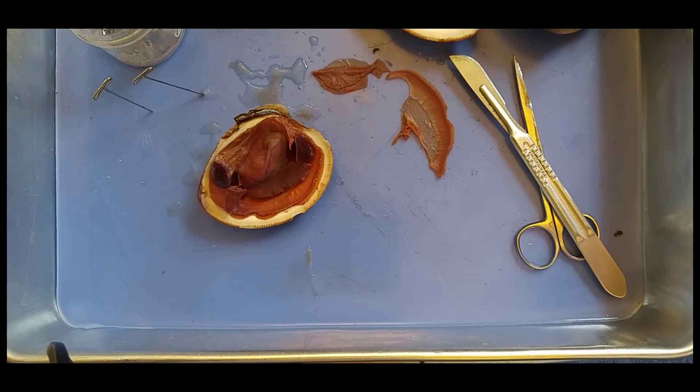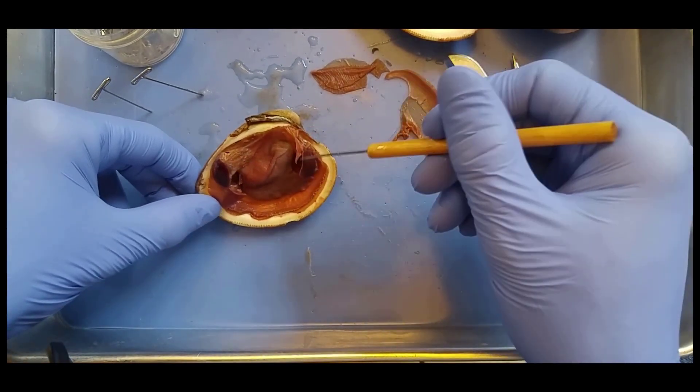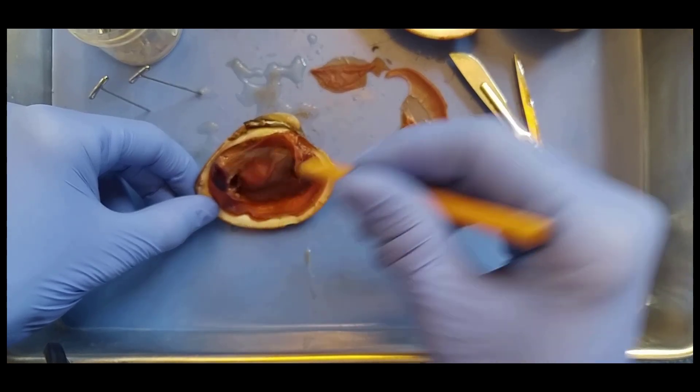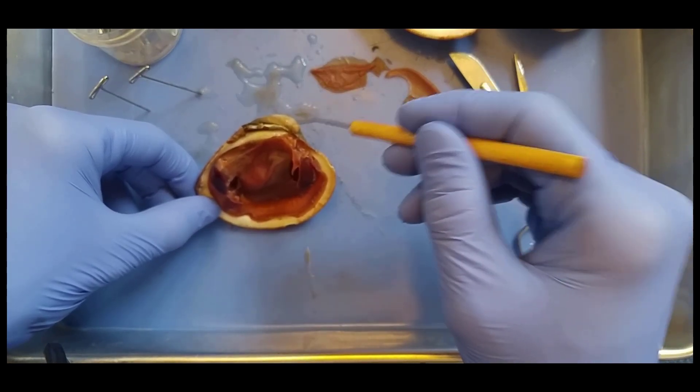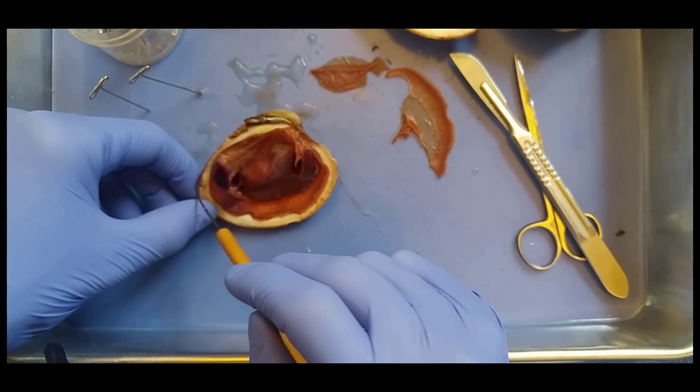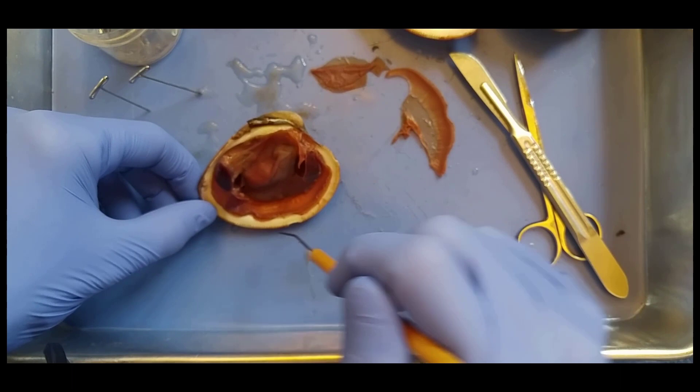And then we have adductor muscles here and here. This is the anterior adductor, posterior adductor. The anterior adductor is the one that's closest to the umbo. So this is the anterior side of the clam, this is posterior, this is dorsal, this is ventral.